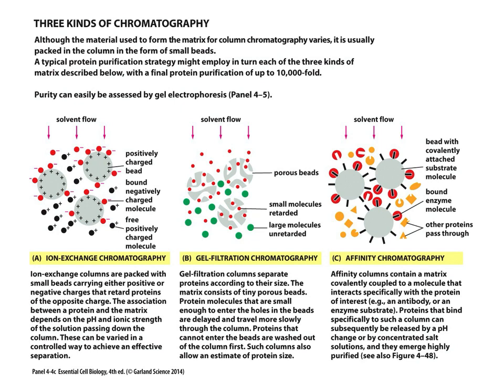Okay. Another type of chromatography is gel filtration chromatography. And so in this case, we're going to have beads that have holes in them, and those holes can be different sizes. And so the proteins, the molecules, have to be a certain size in order to get trapped into the beads. So that means larger molecules would be able to move through that gel. They would not be trapped in the beads, so they would be collected first. You then would add a wash, you would add a solution that would allow for the release of those molecules in the beads.